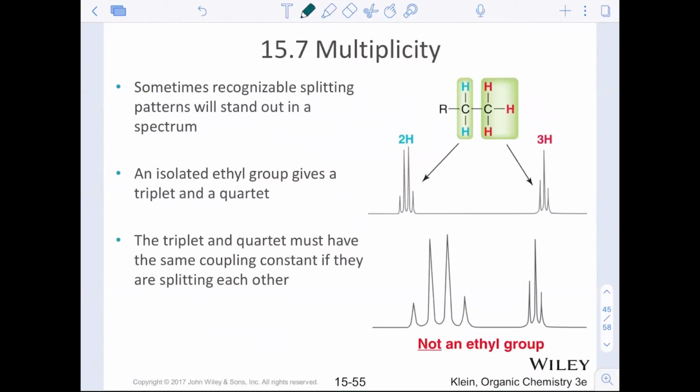What we will deal with is chemically equivalent neighbors. So here's a CH2 group, a methylene group. We have where it shows up on the chemical shift and it has an integration. We have 3 protons, 3 H's, and we have its signal right there as well. Now, what does this actually do? When we're looking at these two groups, they are adjacent to each other. So this isolated ethyl group, CH2, CH3, what happens? The two neighbors, I'll call these A, and I'll call these B.